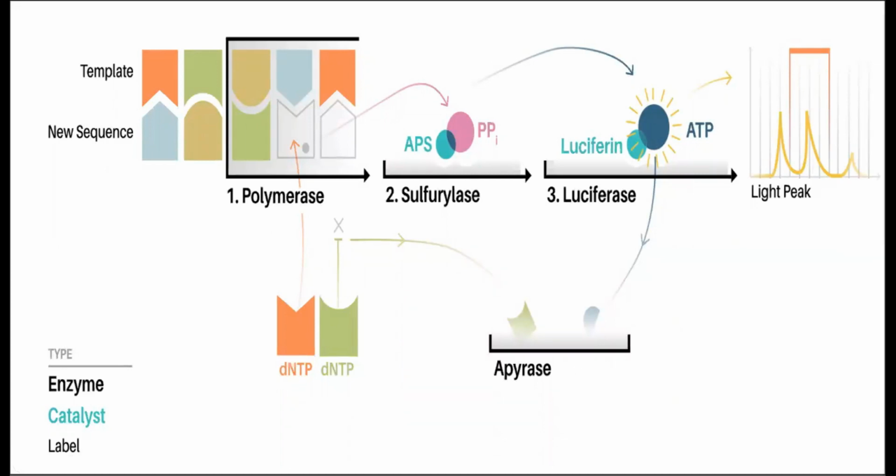Now, the next thing is, this pyrosequencing method is basically used in 2 ways. Either you can go for a solid pyrosequencing or you can go for a normal liquid pyrosequencing. The basic difference between these 2 is that in a solid pyrosequencing, you are doing your experiment on a slide or a particular instrument, a type of well where you actually do the sequencing analysis. You don't want your DNA to be wasted out when you wash the sample.